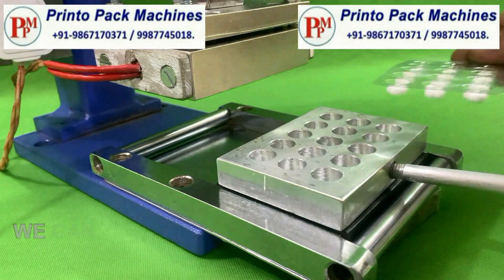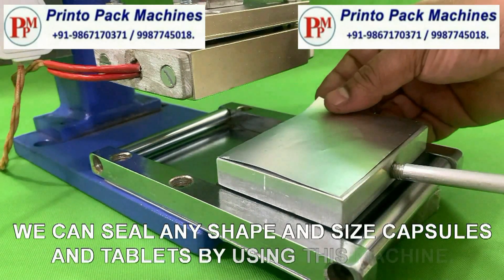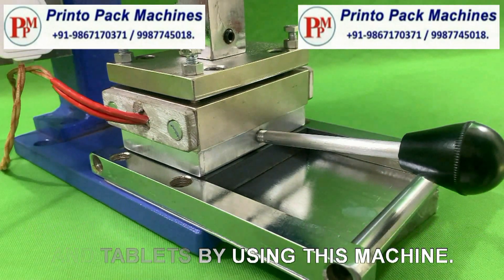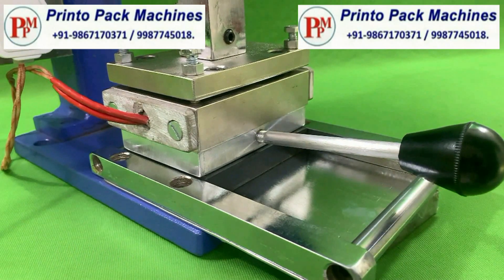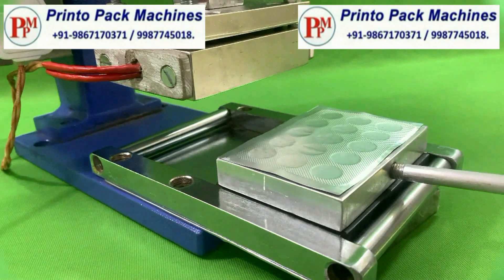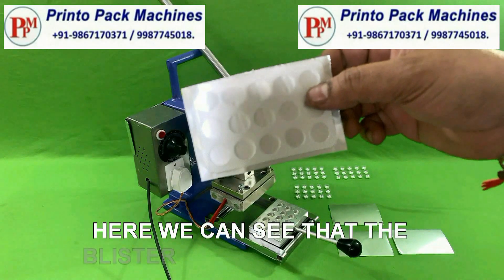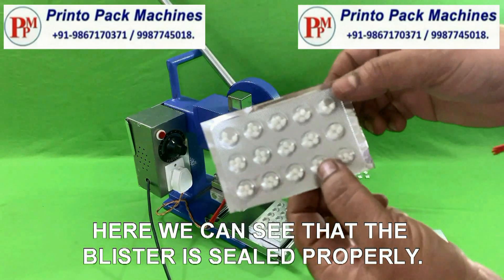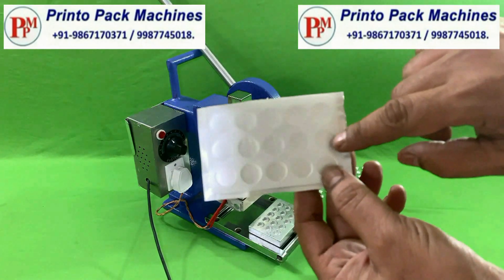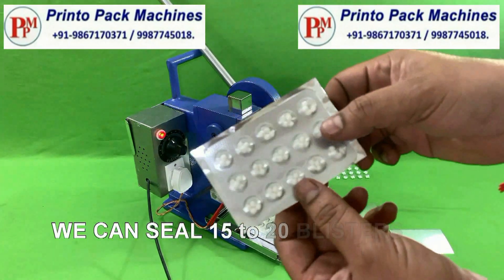We can seal any shape and size capsules and tablets by using this machine. Here we can see that the blister is sealed properly. We can seal 15 to 20 blisters per minute by using this machine.